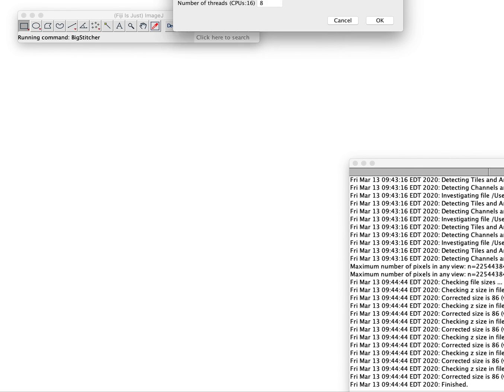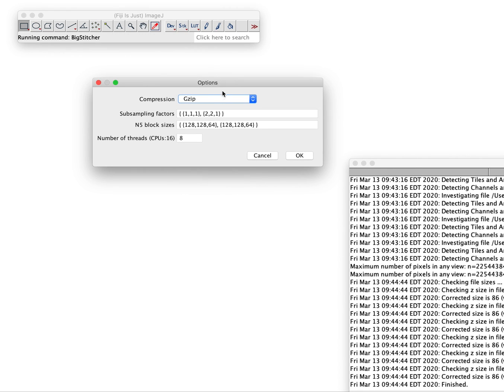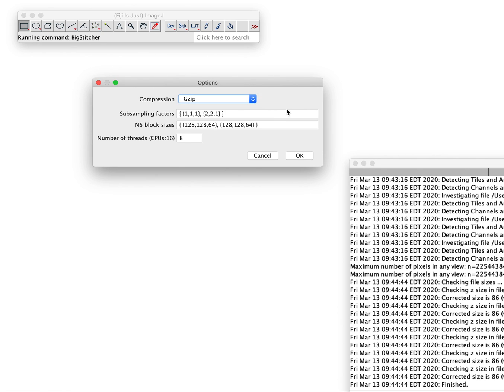Now we create, we say resave it at N5. We do okay. It asks us about the compression we want to use for each block. It really saves each image into little blocks of different resolutions. It suggests to do it at these subsamplings. That's full resolution 1-1-1, and then 2 times downsampled in X, 2 times downsampled in Y, not downsampled in Z. And the block size 128, 128, 64.